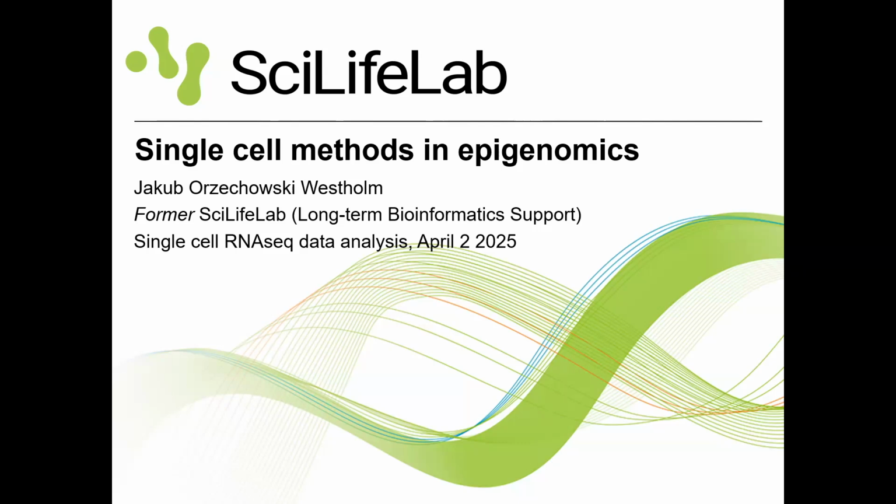I don't remember the details of this, but when I've been doing this, I've been using 10x Cell Ranger ATAC, and they have their methods documented in a special algorithm documentation, so you can look it up there. But I know that you don't run an additional experiment to get a baseline. You don't do any IgG or inputs.